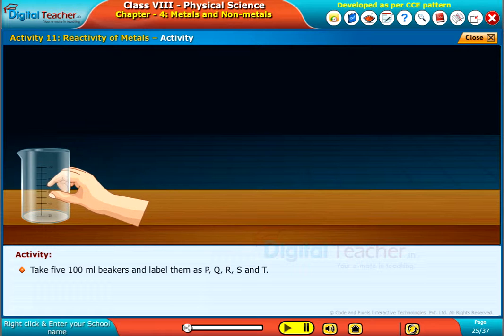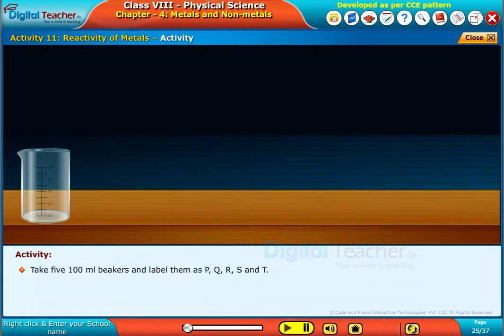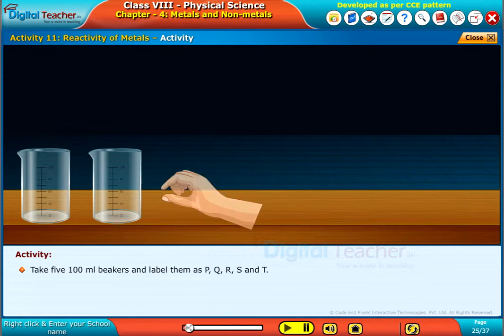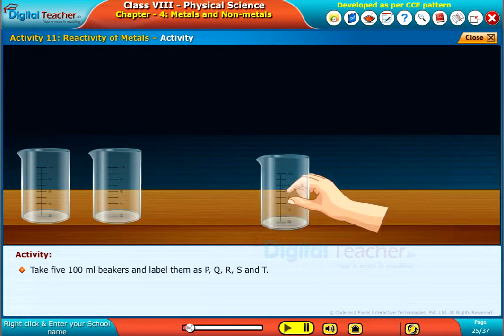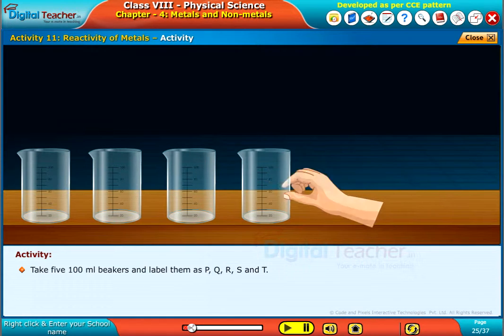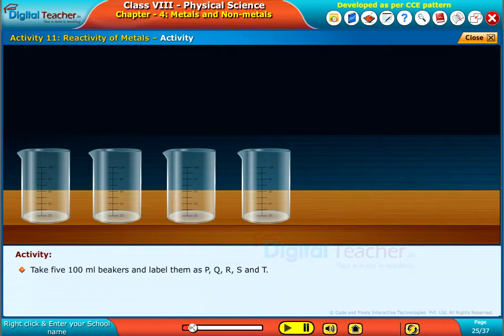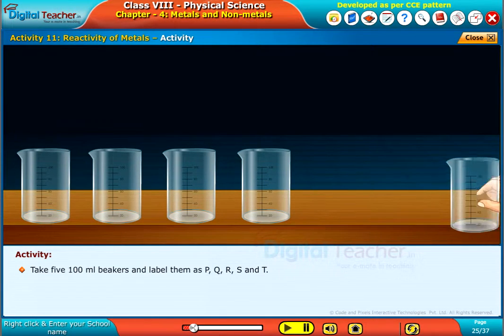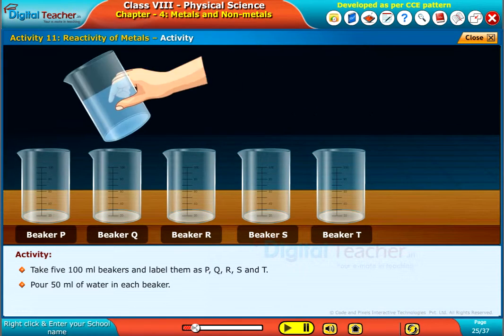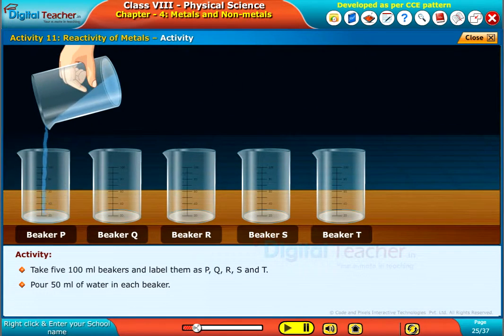Take 500 ml beakers and label them as P, Q, R, S and T. Pour 50 ml of water in each beaker.